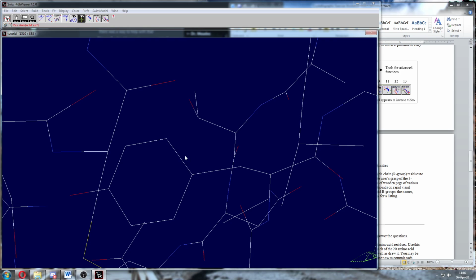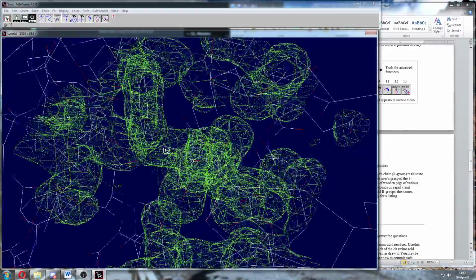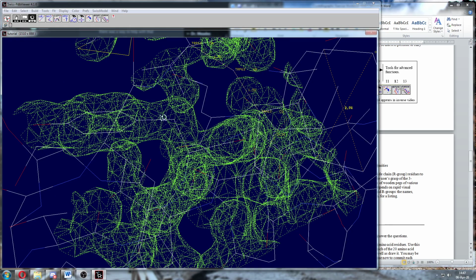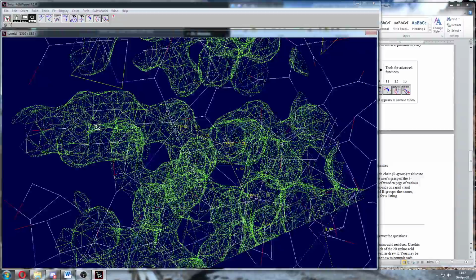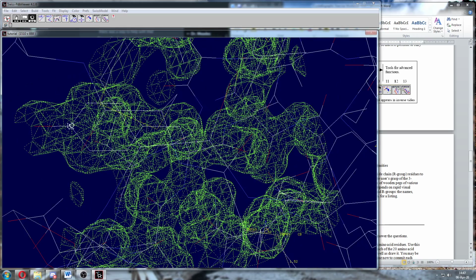So if I center on it, I'm going to center over here on the alpha carbon again. Zoom out just a little, right? You see it's definitely tyrosine. I got it sticking off to the left there. Right, so here's your alpha carbon, beta carbon, gamma carbon. There's 2 delta carbons because it splits into the ring, right? 2 epsilon carbons, right? And then it converges onto a single carbon with the OH group on here, right?